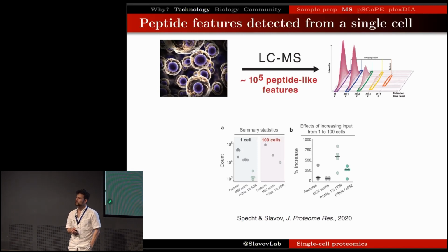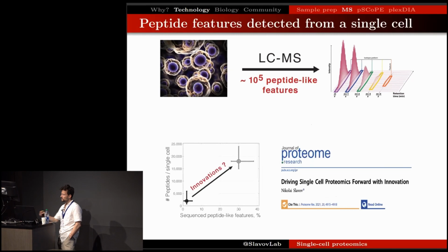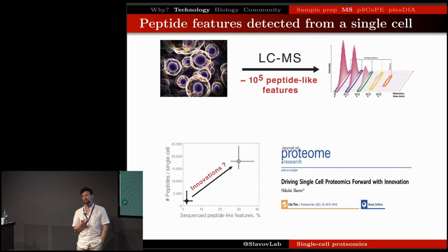And I thought that was really noteworthy, because each of those peptide-like features corresponds to a peptide. Some of them are not identifiable. They might be modified, but they're present there at dozens of copies, some of them hundreds and thousands of copies. And we simply fail to assign confident sequences to many of them. And this really framed the question for me very clearly, that the challenge is how to do the data interpretation.